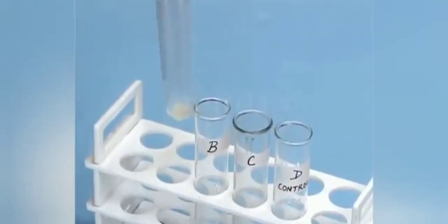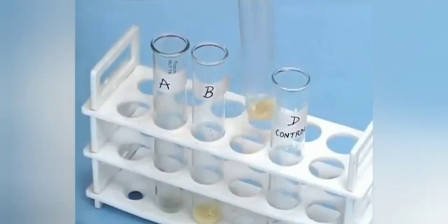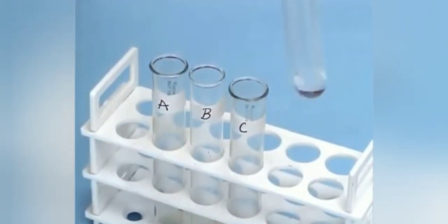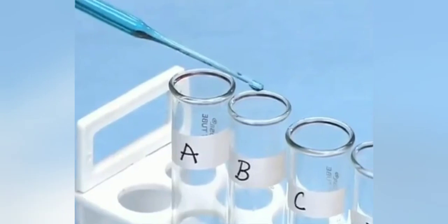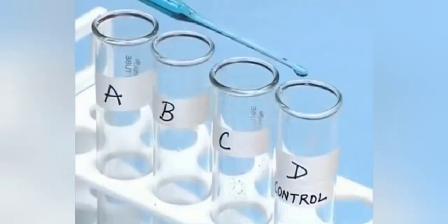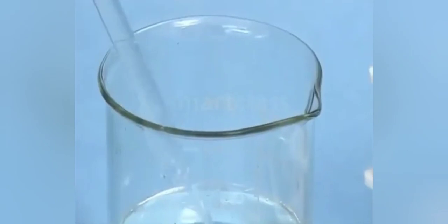Shake all the test tubes well. Now, with the help of a dropper, add 2 drops of copper sulfate solution and a few drops of caustic soda to each test tube.